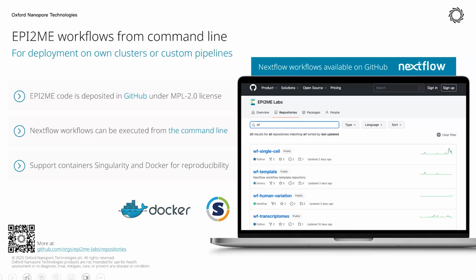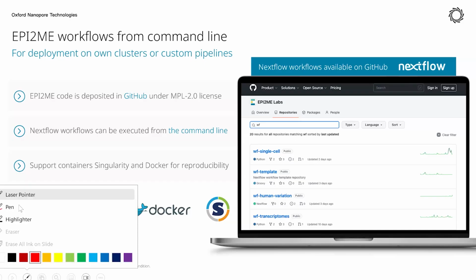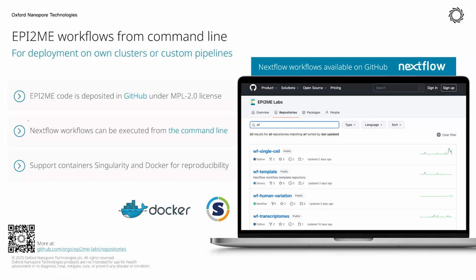And these just basically make it easier to use it in our graphical interface. The workflows are all based on Nextflow, and all of the software that's run to do the analysis is containerized into Singularity and Docker, which helps for reproducibility across a number of different systems.